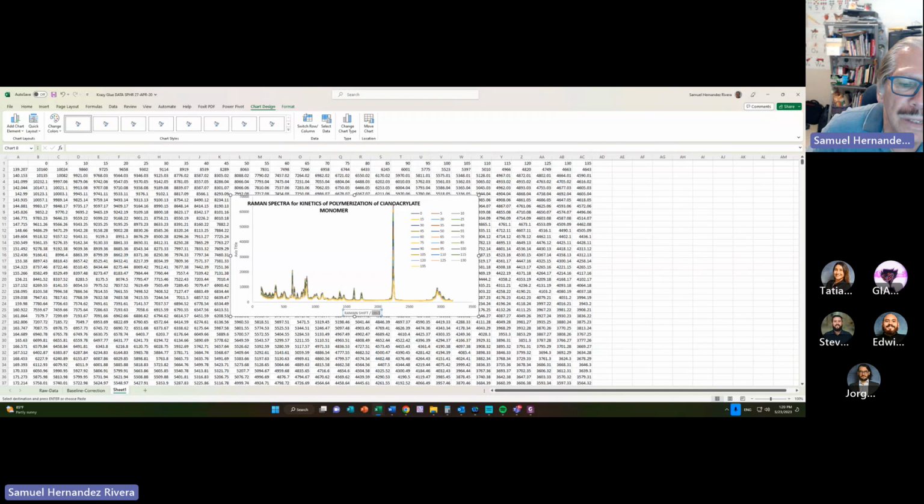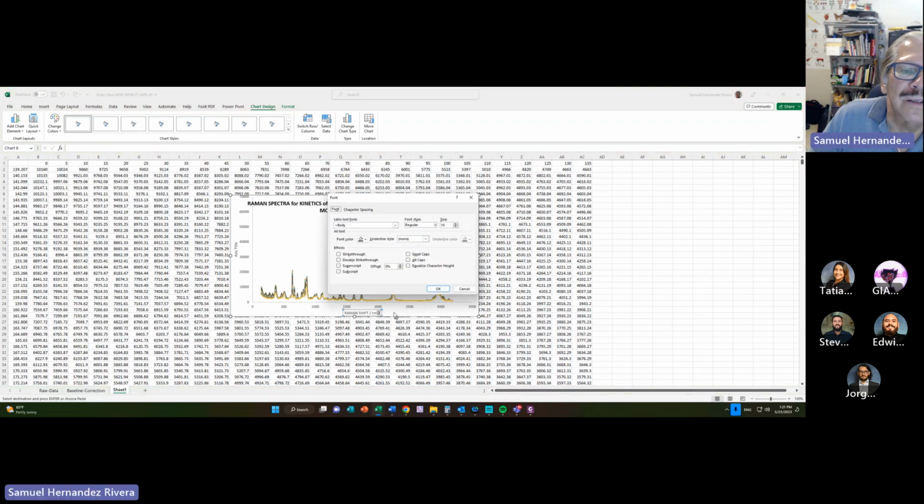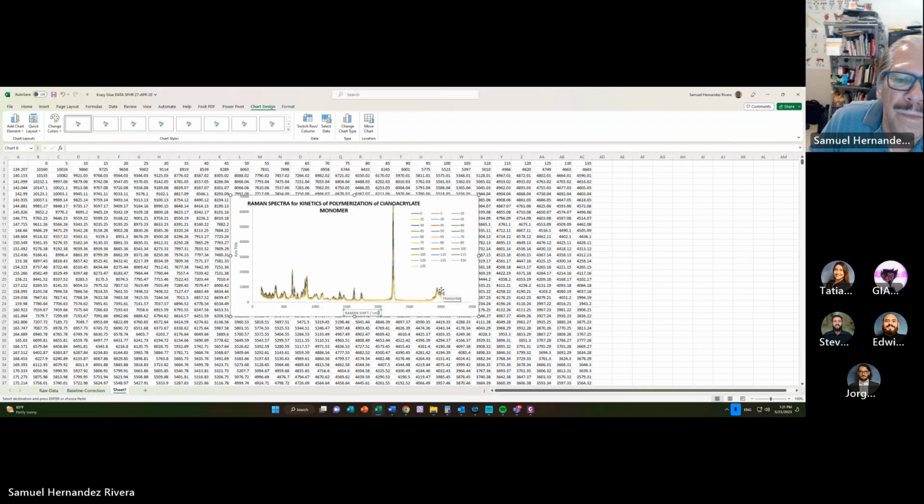And it didn't write it well, so we shade the -1, and with the right click on your mouse, you go to font and specify superscript. Yes, working like a charm.